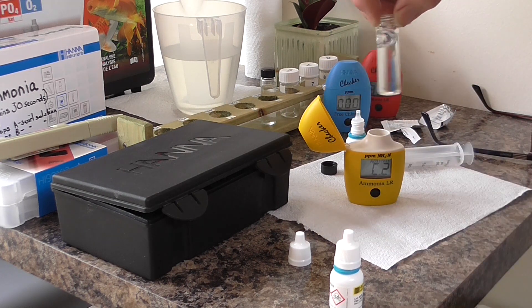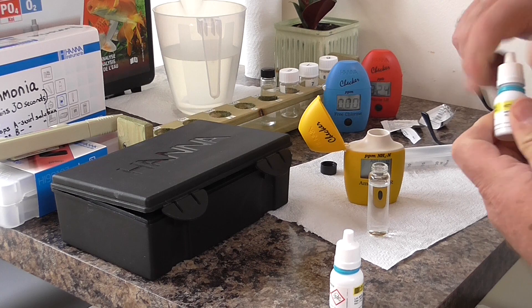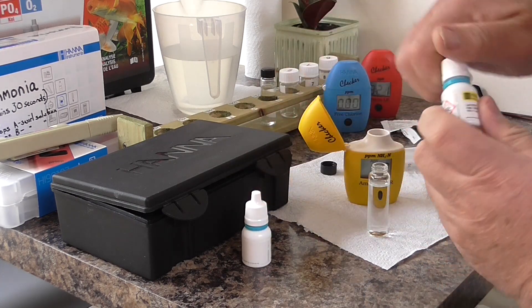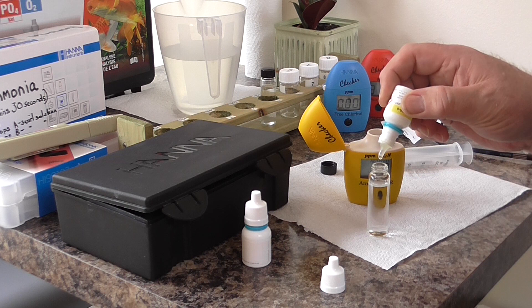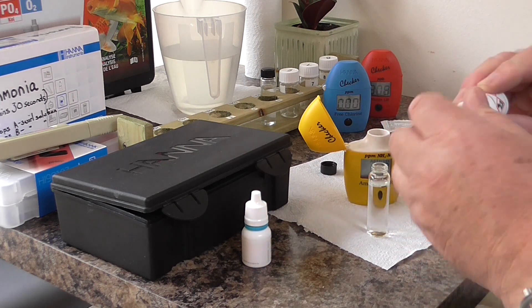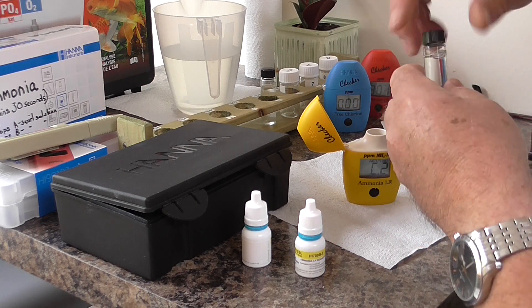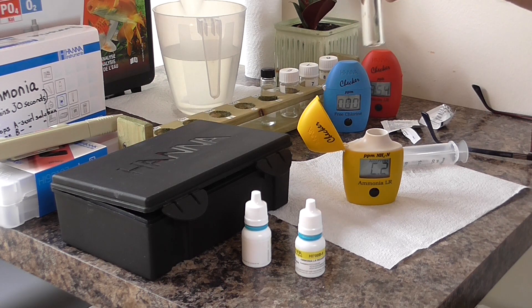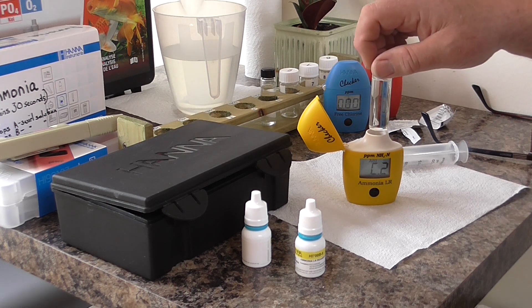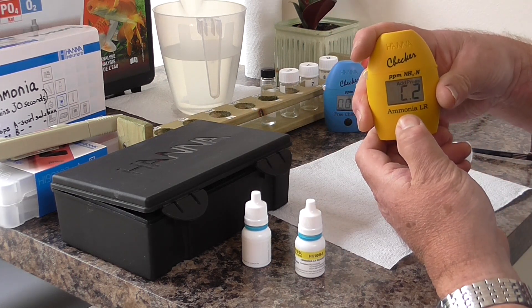Give it a gentle shake, get the top back on that one. And four drops of reagent B: one, two, three, four drops of reagent B. Turn again, gentle shake, get the top on, swirl the solution around, put it in, click it down.